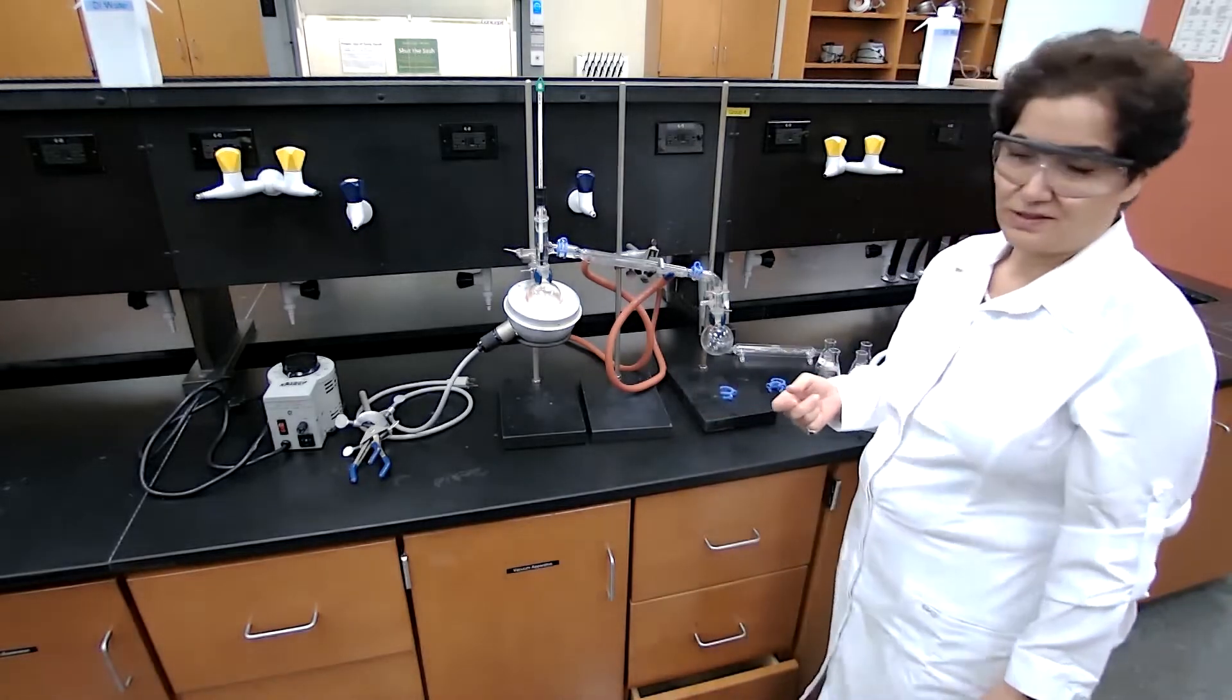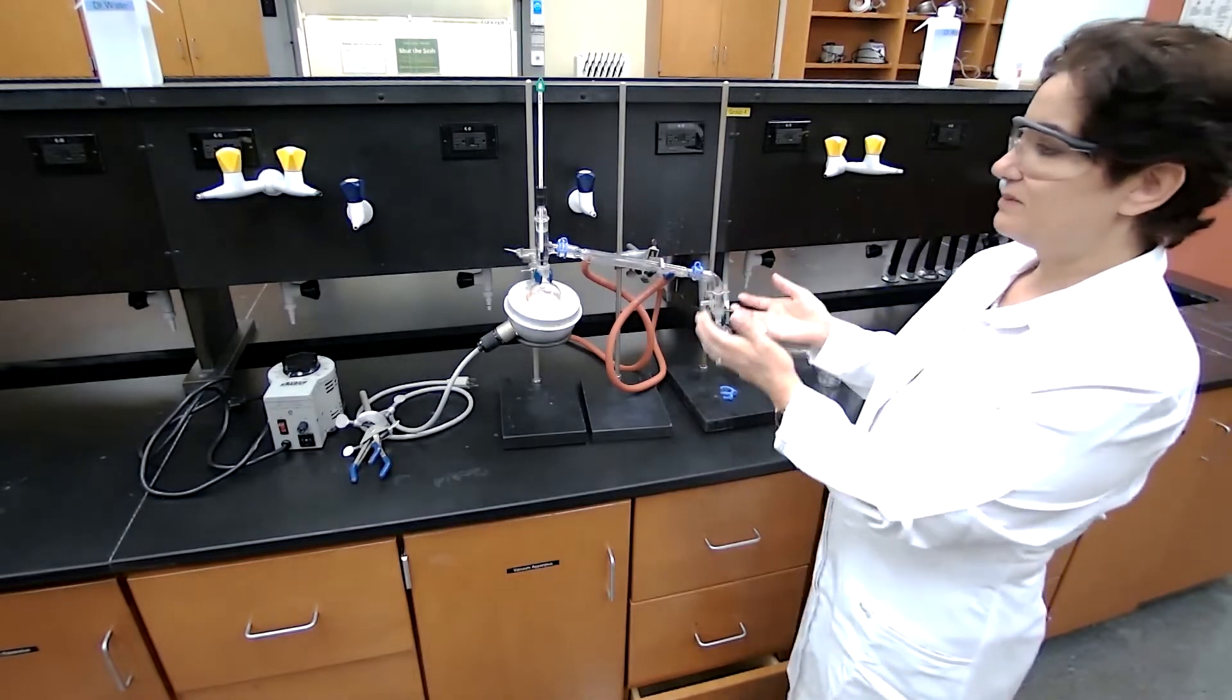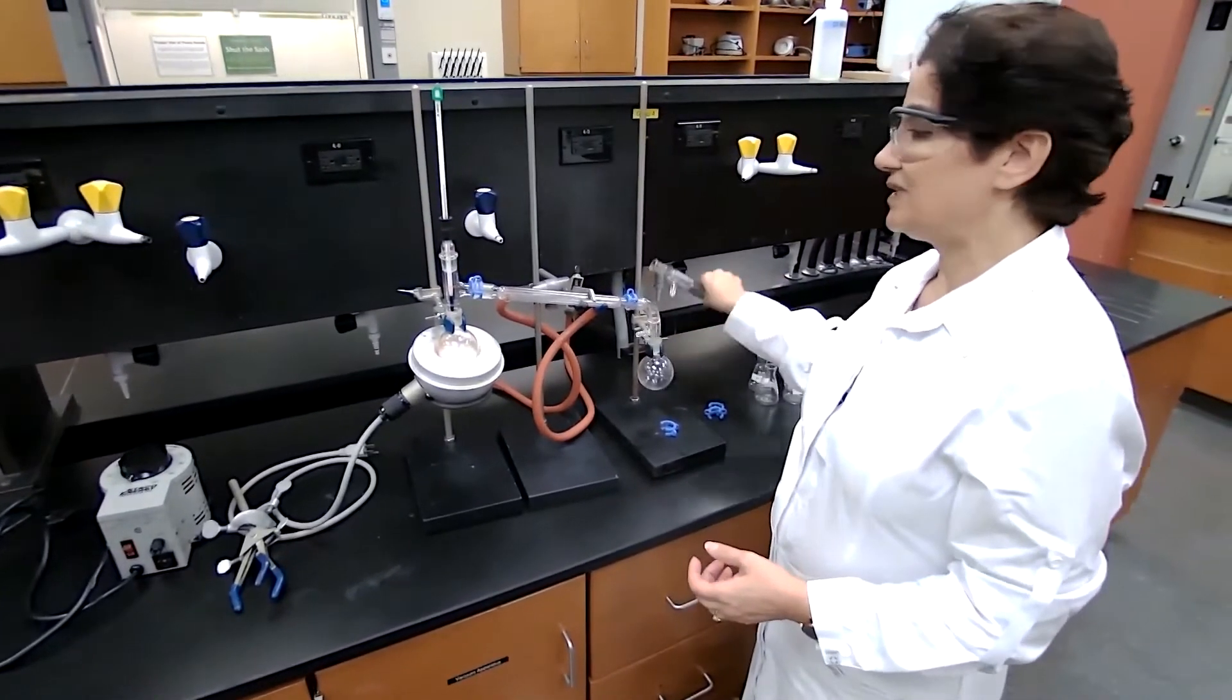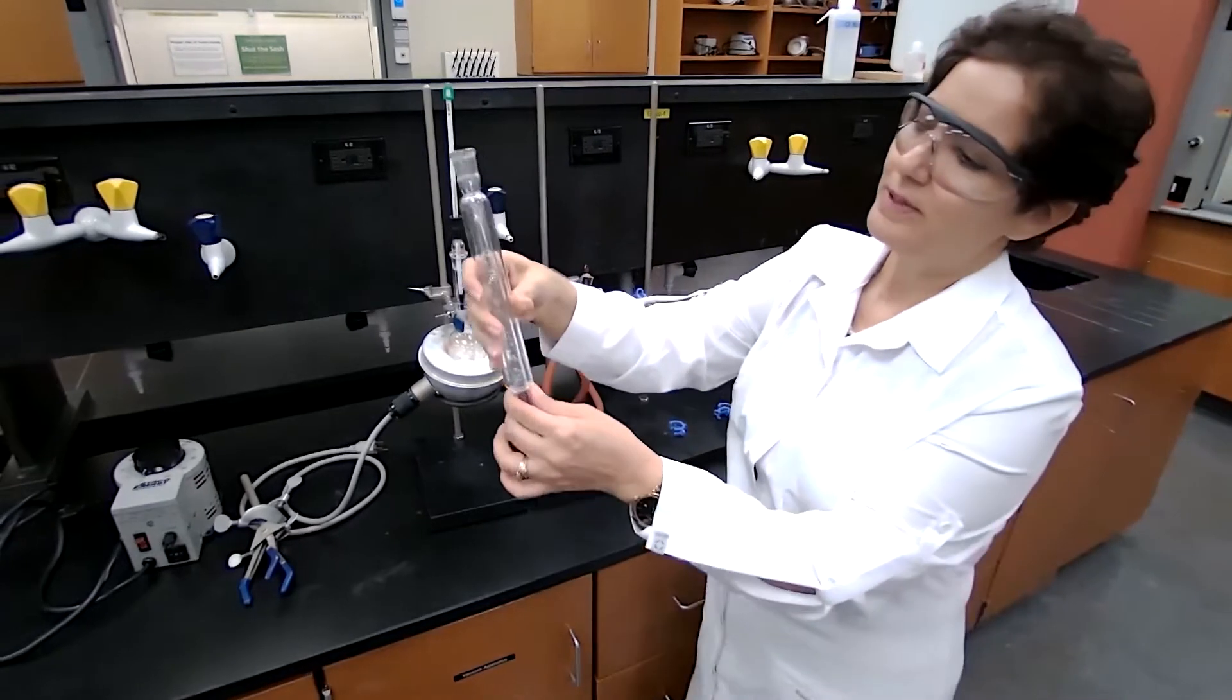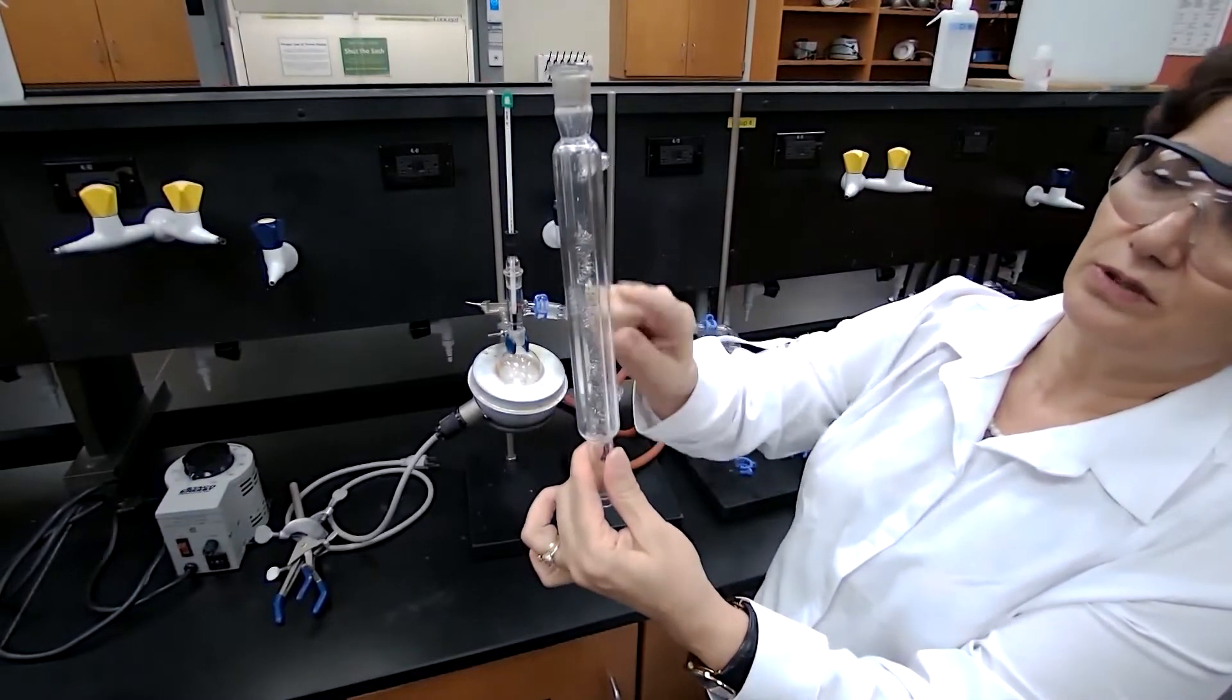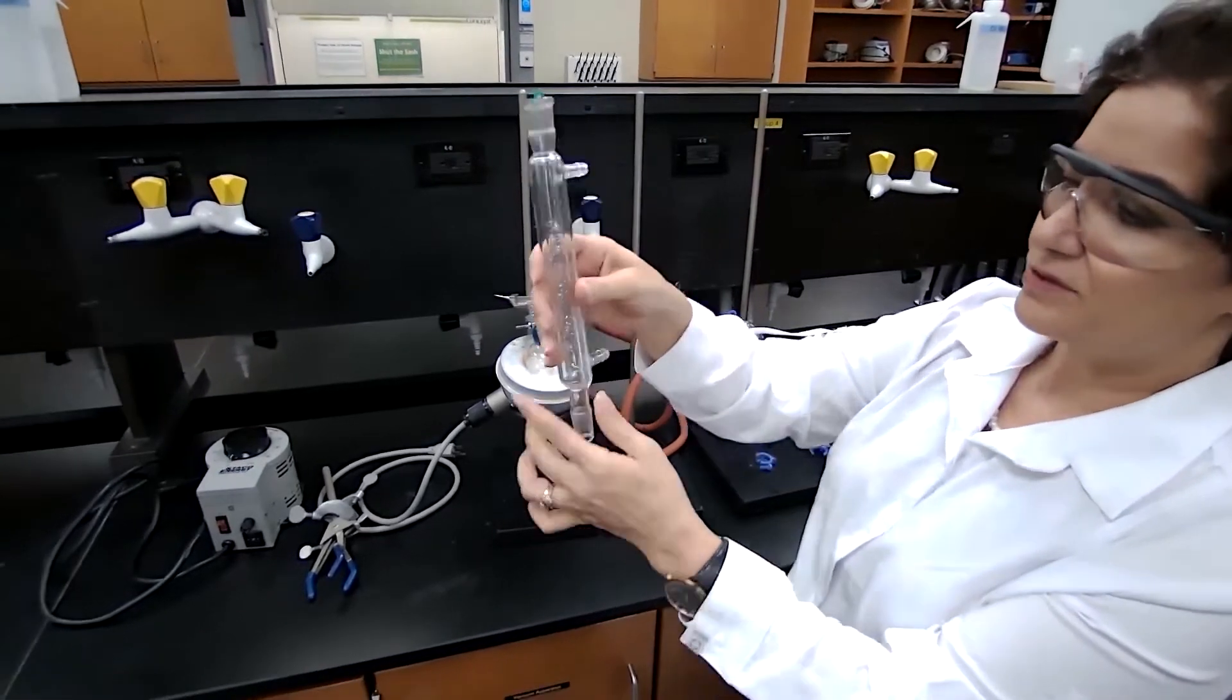In terms of apparatus, you just saw me assembling a simple distillation. The difference between simple and fractional distillation is addition of a fractionating column. It could be like this homemade one - we are adding steel wool to the condenser and we use that as a fractionating column. It's going to be inserted between the boiling flask and the distillation head.